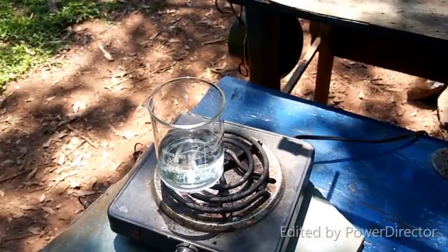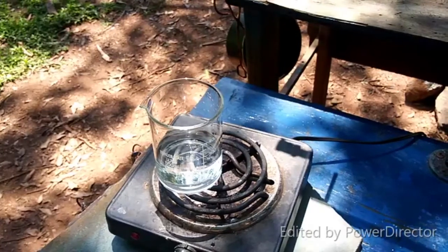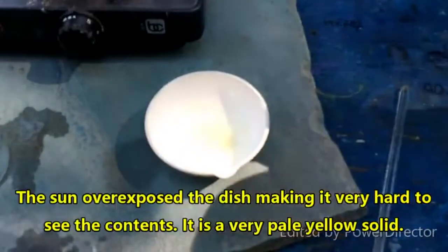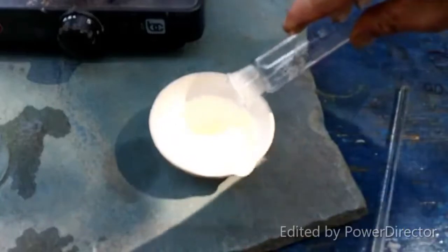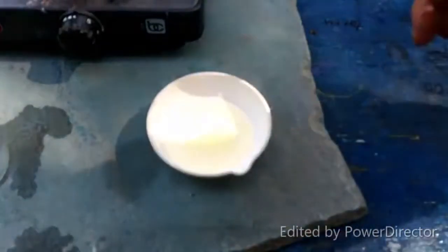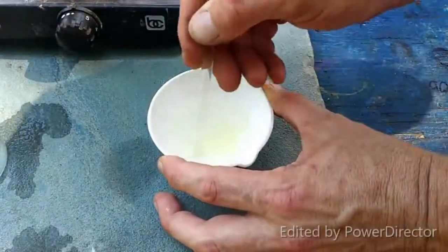I actually had to heat it a little bit more to get it to completely solidify on cooling. Here is the 25 ml of acetone — sorry that the sun is probably washing a lot of this out.